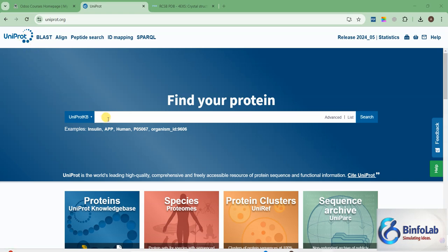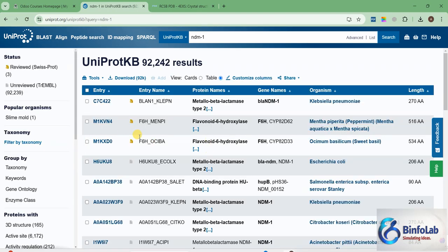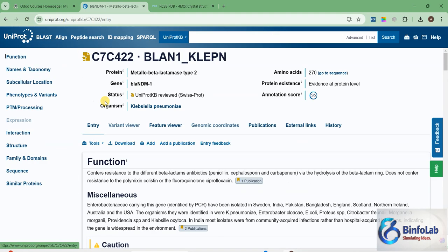I will pick a sequence from UniProt and add some ions and some ligands, just randomly, just to tell you how things work and how you can use Boltz for your research. So as usual, I'm picking one of my favorite proteins. From here, I will just pick randomly, let's say from Klebsiella pneumoniae, this one.